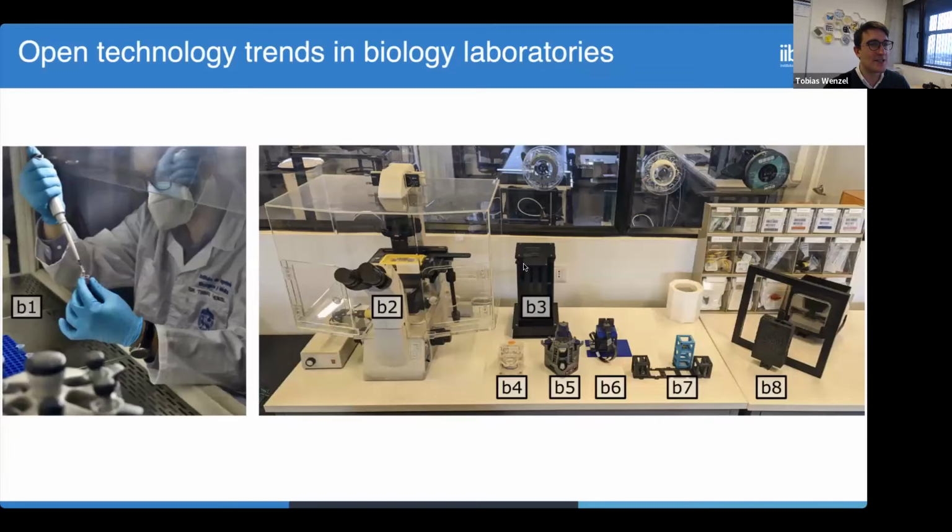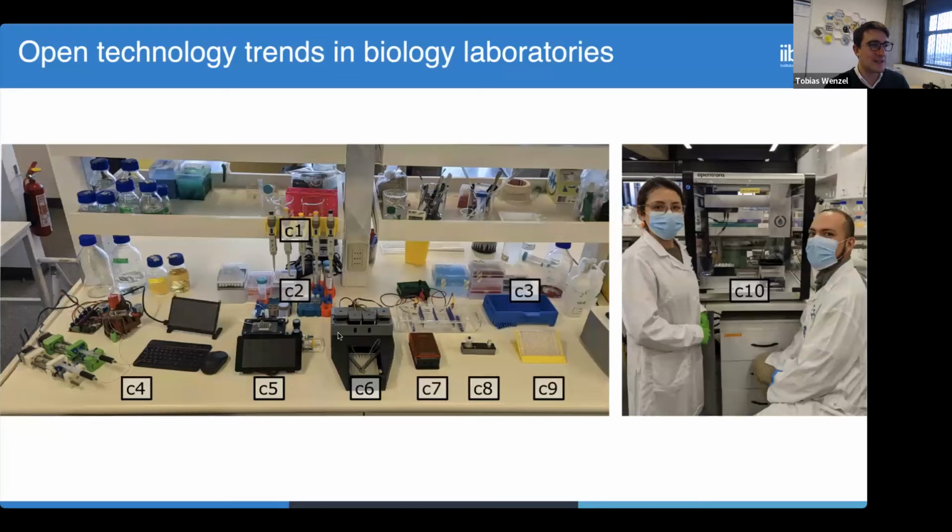And so the next 2 pictures are actually from our lab. So again, this is a reused microscope, but we made some 3D printed adapters, for example, around bioimaging. There are all kinds of really cool open hardware instruments that are already published and released, a lot of them usable with 3D printing and laser cutting. And there's liquid handling, gel electrophoresis, and transilluminator, plate holders, pipette tip sorters, syringe pumps, and microfluidics equipment, all kinds of interesting things, pipette holders that are available, including the Opentrons robot, which is also a kind of community platform, like an open source commercial tool.